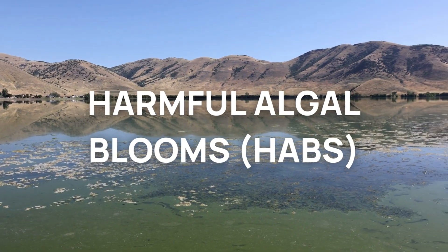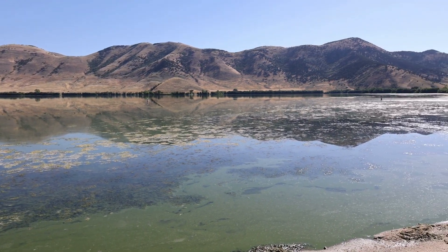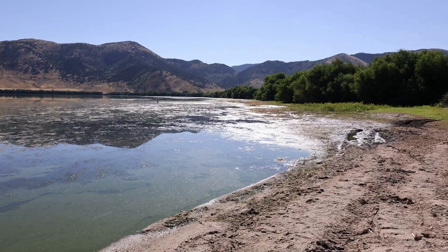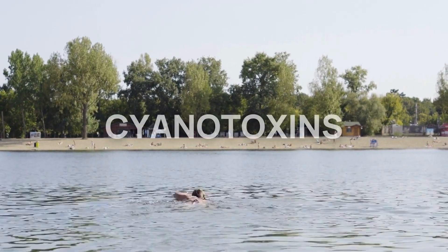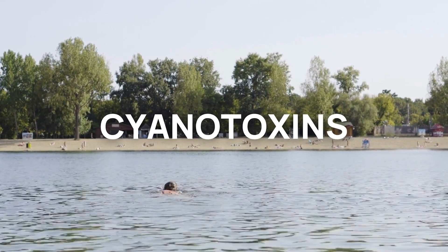Harmful algal blooms, or HABs, develop when naturally occurring cyanobacteria in the water multiply very quickly to form green or blue-green water, scum, or mats. Blooms can produce potent cyanotoxins that pose serious health risks to humans, pets, and livestock.